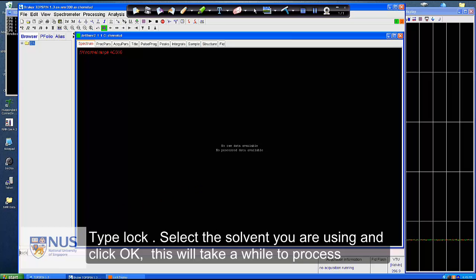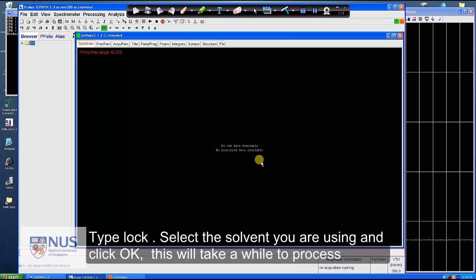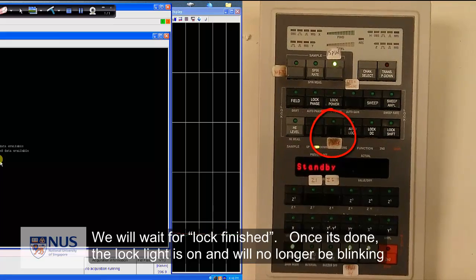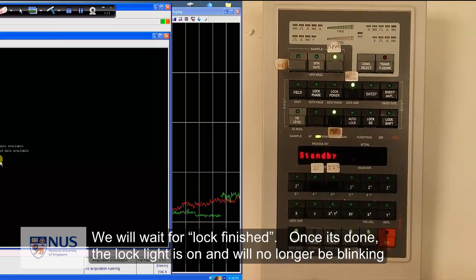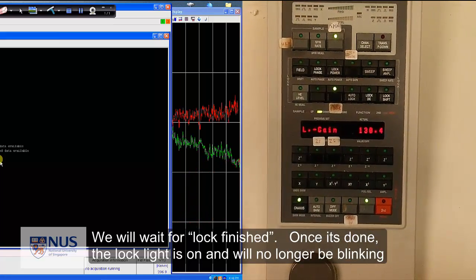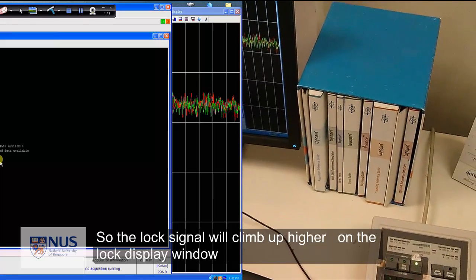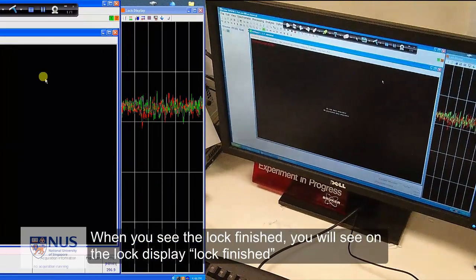Type lock, L-O-C-K, to select the solvent you are using and click OK. This will take a while to process. We will wait for lock finished. Once it's done, the lock light is on and will no longer be blinking. The lock signal will climb up higher on the lock display window. When you see lock finished, it is time to do shimming.